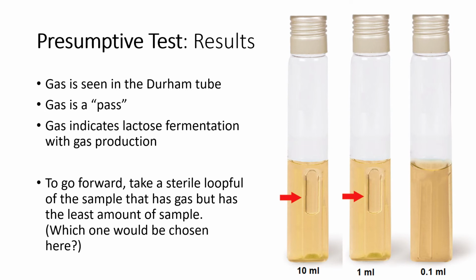So remember, I'm looking for the presence of E. coli. It looks like it might be in these two tubes that both have greater concentrations of your original sample than the last tube, which has a tiny amount. So if you do have a fecal contaminant in your water sample, your well, your pool, whatever, it might not actually be that bad, because if it were a really bad situation, it would be present even in the lowest concentration.